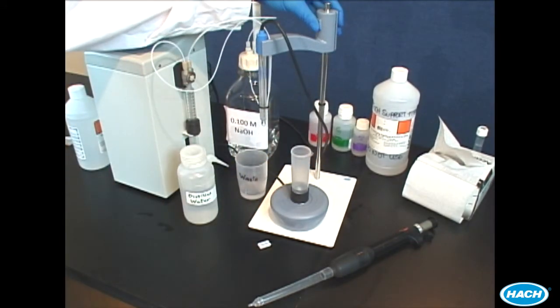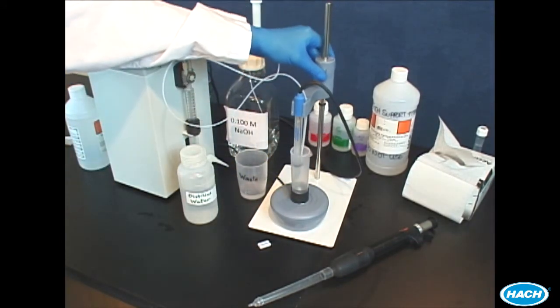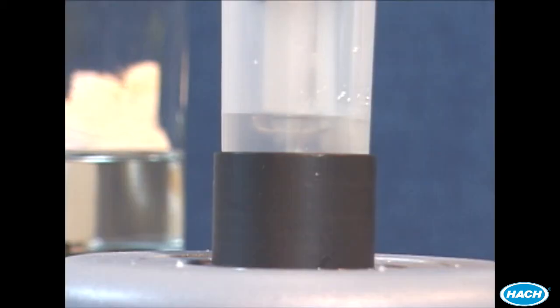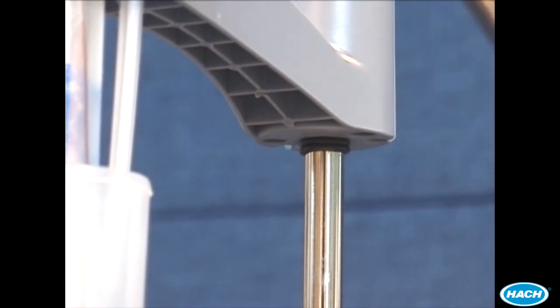Lower the electrode into the titration cell. Make sure the entire pH bulb is immersed into the sample and not hitting the stir bar. When you have determined the proper depth of immersion, you can adjust the O-ring on the stir stand to help quickly locate the proper depth.